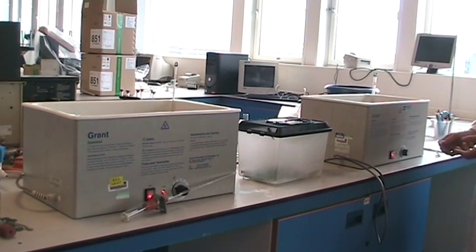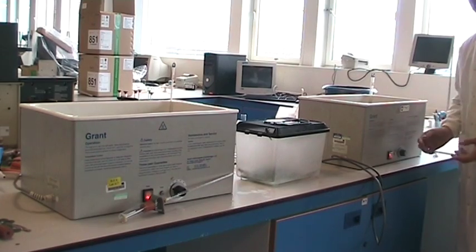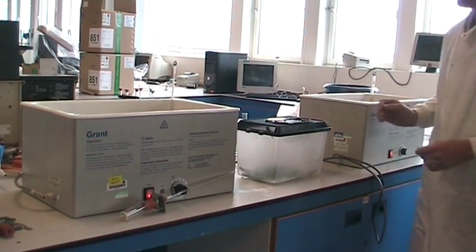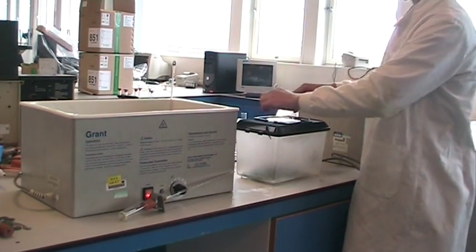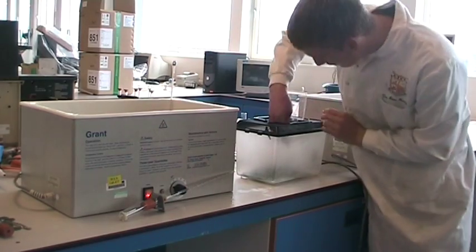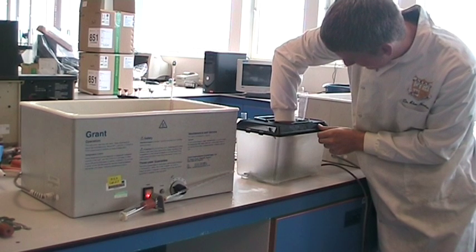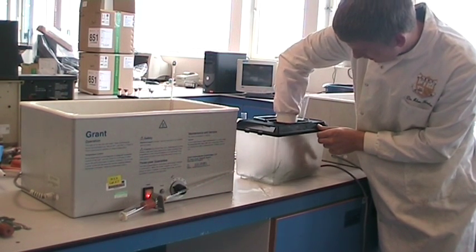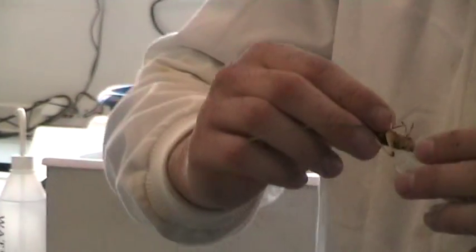This practical demonstrates the effect of temperature on metabolic rate. A simple way of doing this is to measure the oxygen consumption. In this case we're using locusts. I'll get one of those. To measure the oxygen uptake, we put them in a tube.